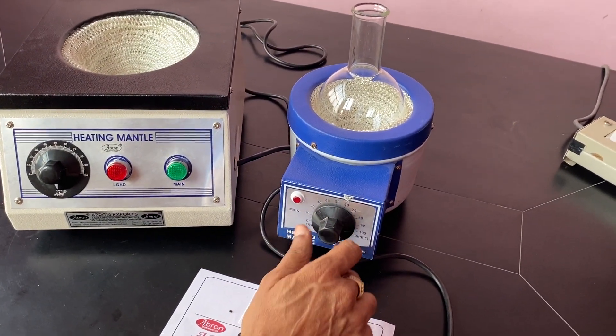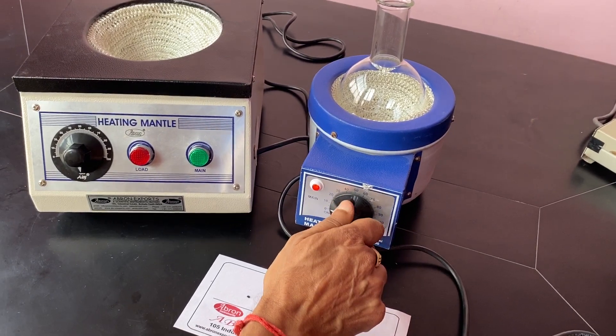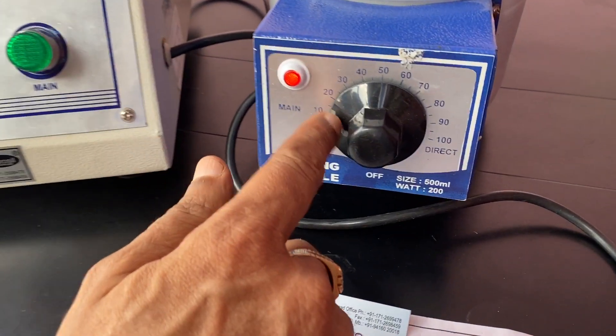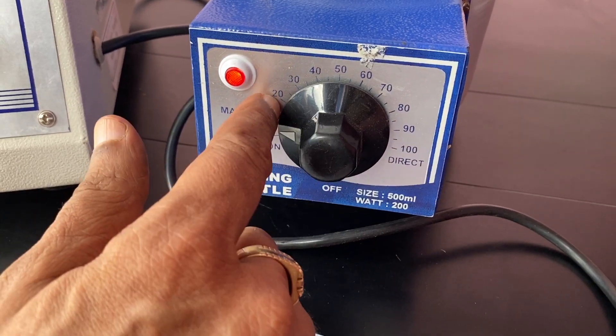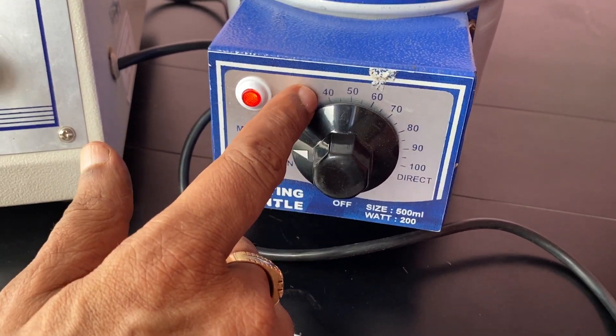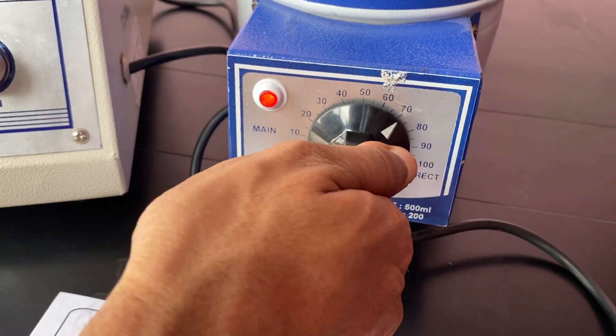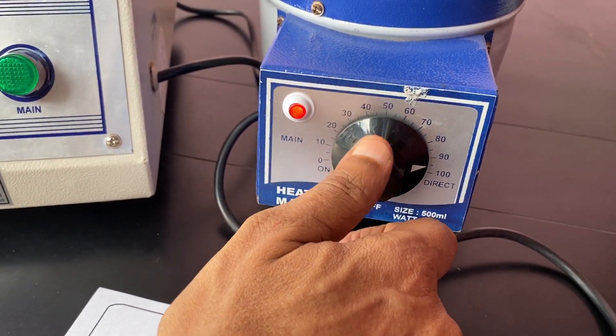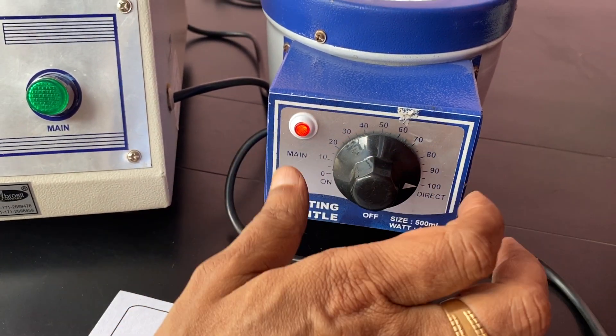This is an energy regulator — you can just increase it. See, this light is coming on, so heating is going on. There is a gear; you can put it up to 30 or 40 for slow heating, 40 to 70 or 80 for fast heating, and 80 to 90 for very fast heating. But never keep it on 100.